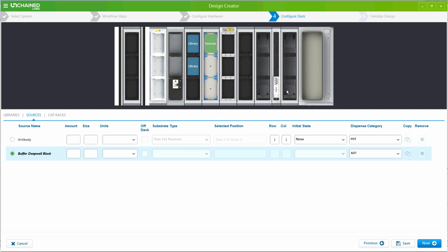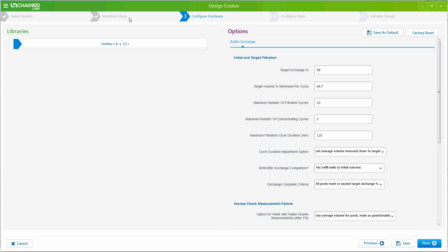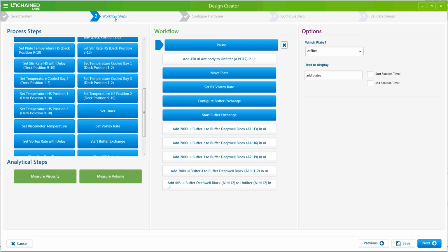So the next step, you'll see within these individual steps, if I make a mistake or I want to change something, I can hit the previous button and go back to it. I can also click on these individual chevrons at the top to return to a certain tab. I wanted to point out that within each of these tabs, I've already mentioned that you have an error checking or at least an information checking process. This also is a level of checking within the task. So if I entered incorrect information or something that was not available to it, the information goes back to red. So it's an error checking within the individual step and then tells me how I need to correct it.